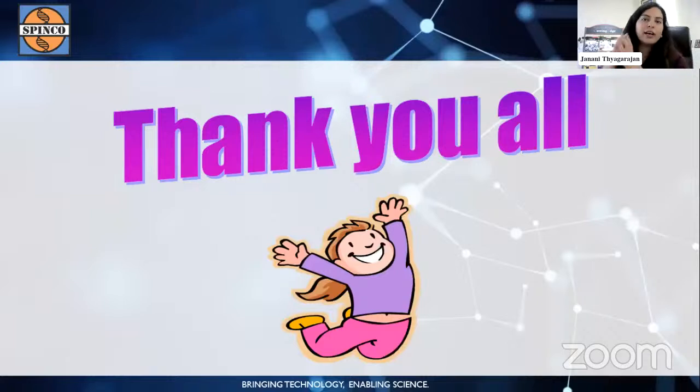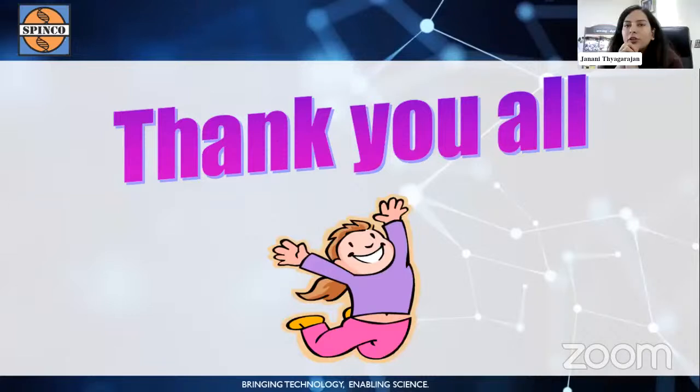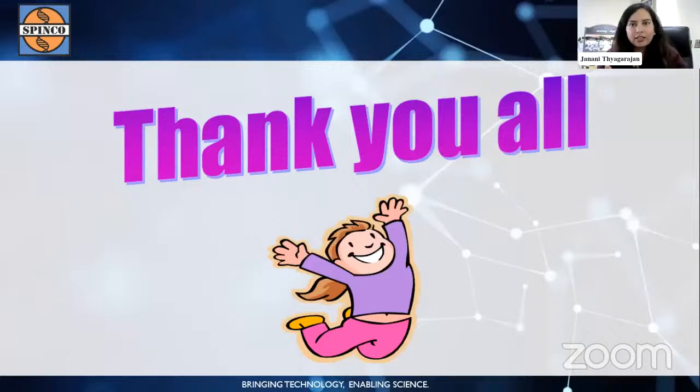We have Bharat Kumar who's asking, hi sir, can you please share what is centroid and profile mass in the mass spectrum of LC-MS? We'll do that when we talk about the interpretation of the mass spectra. We are having two or three sessions on qualitative and two sessions on quantitative analysis. The qualitative analysis will talk about the centroid as well as the vertical line. So that will be answered in the subsequent sessions.